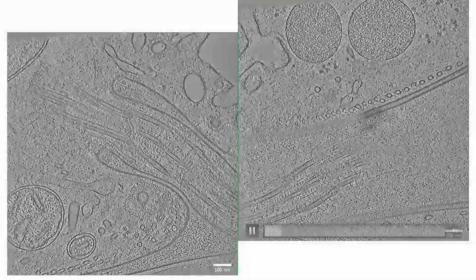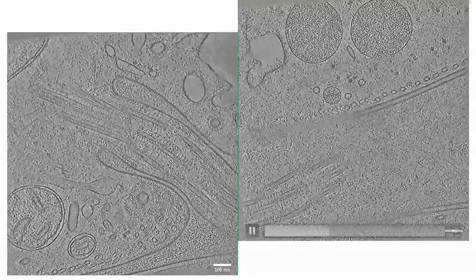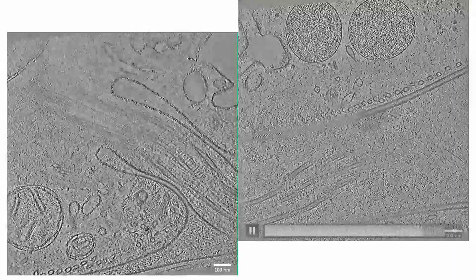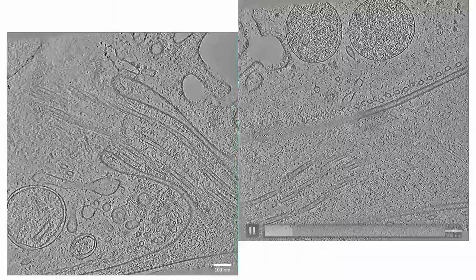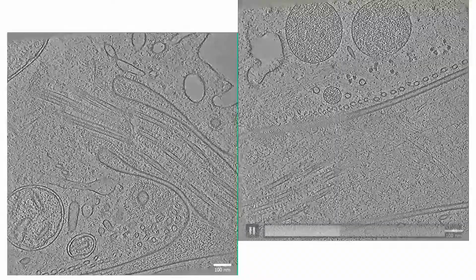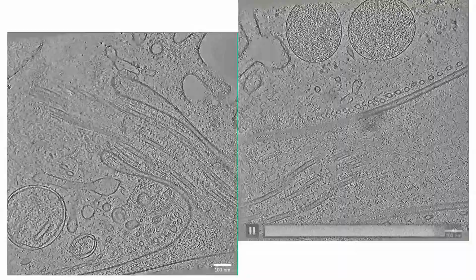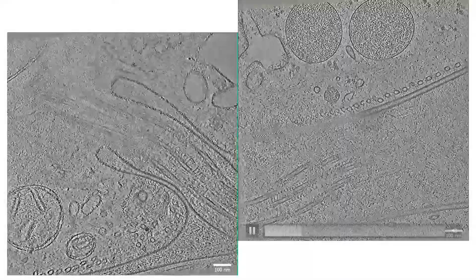that continues with this area. You can see the subpellicular microtubules, and they start to disappear when they enter the region of the flagella pocket. They become incomplete as they approach the entrance of the flagella pocket.